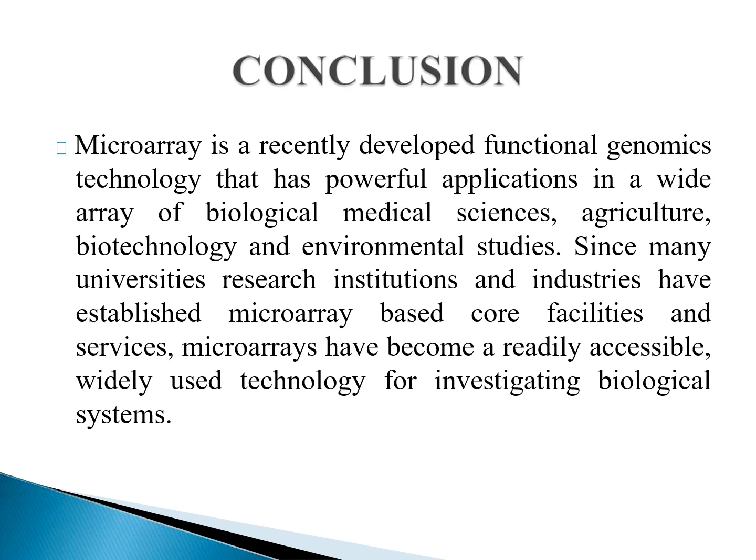So, conclusion: microarrays are a recently developed functional genomics technology that has powerful applications in a wide array of biological and medical sciences, agriculture, biotechnology, and environmental studies. Since many universities, research institutes, and industries have established microarray-based core facilities and services, microarrays have become a readily accessible, widely used technology for investigating biological systems.